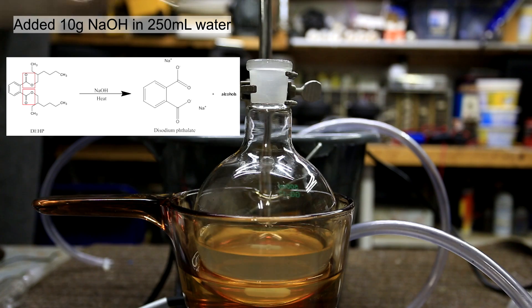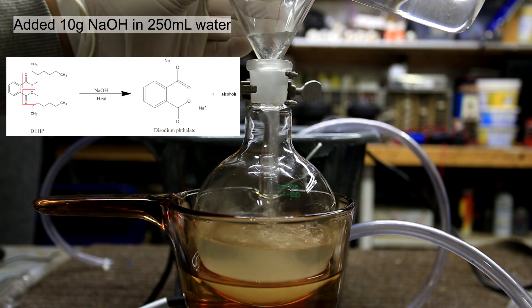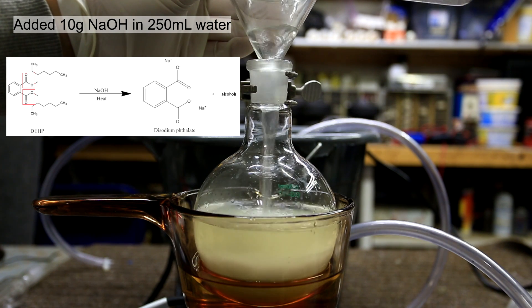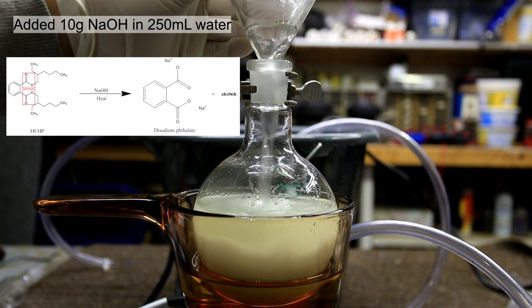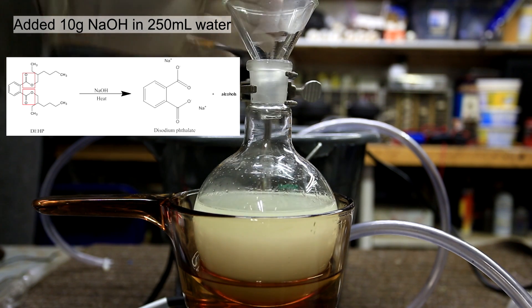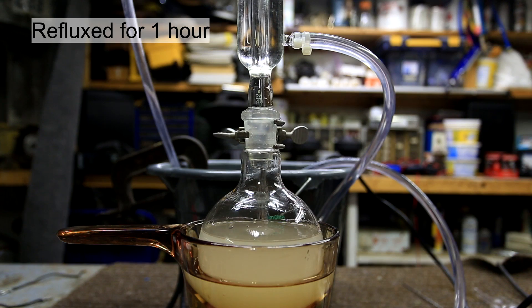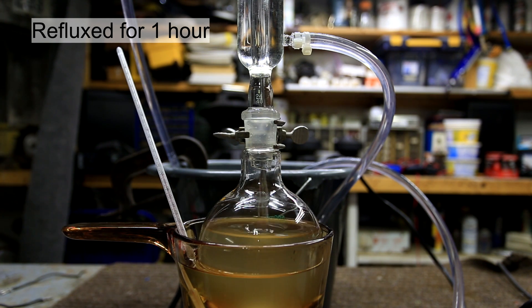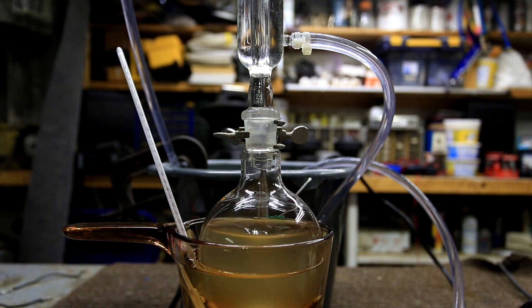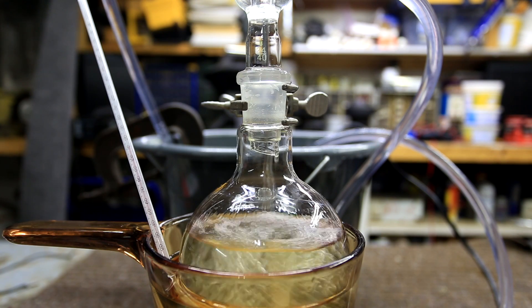After two hours the Soxhlet extractor is removed and 10 grams of sodium hydroxide dissolved in 250 milliliters of water was added. This step is a base ester hydrolysis where the ester bonds in the red box are hydrolyzed. This forms the salt form of our desired phthalic acid product as well as alcohols. To complete the ester hydrolysis reaction we need to add some heat, so the solution is brought to a reflux. I only refluxed it for about an hour but it's probably better to reflux it for around two to three hours.